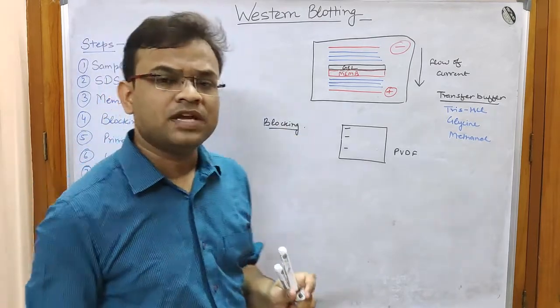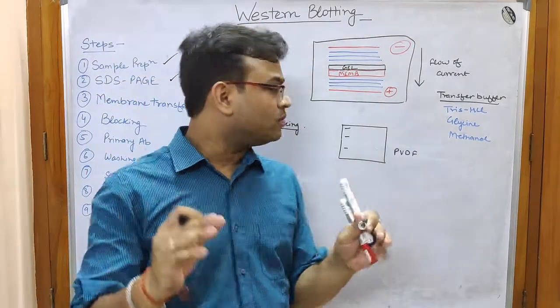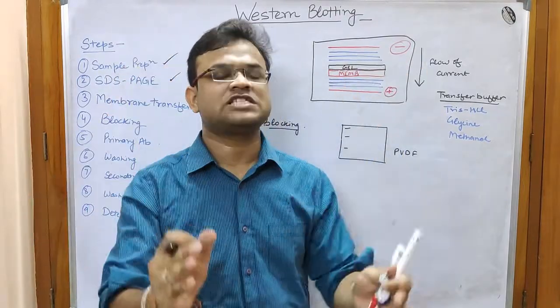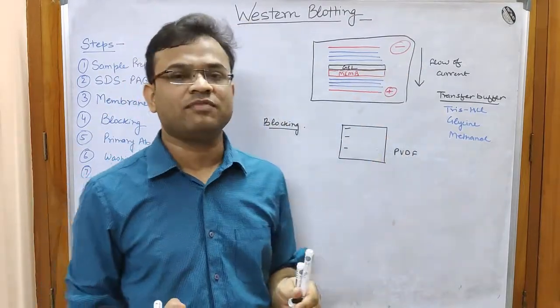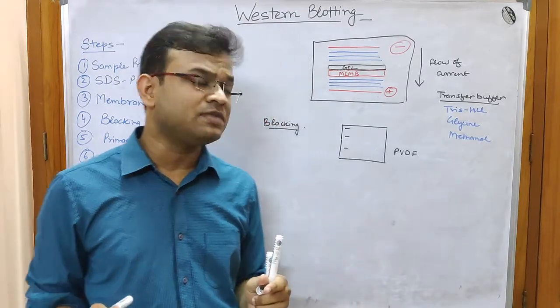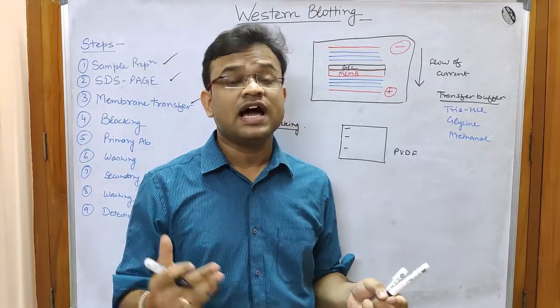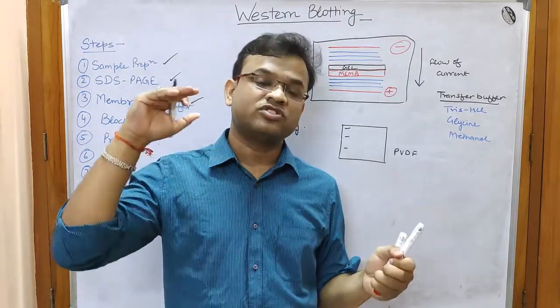So what does blocking mean? Blocking means to block all the non-specific sites on the PVDF membrane. What does non-specific site mean? The sites where the proteins are not present, that can give false positive results.